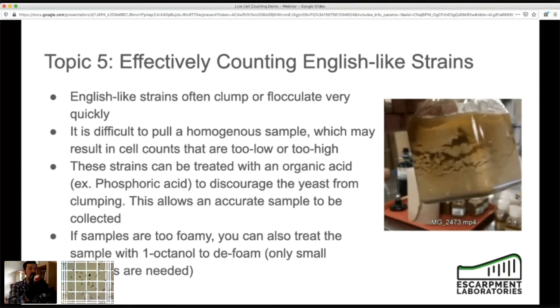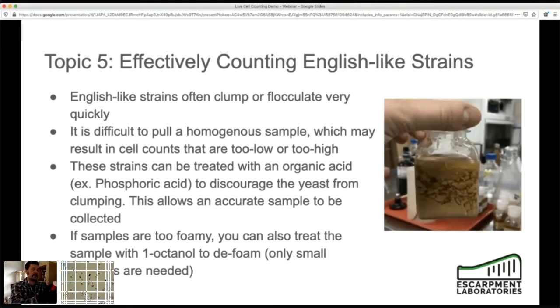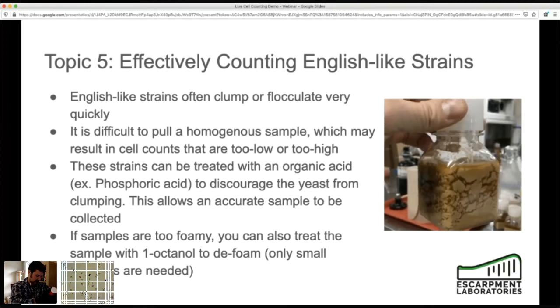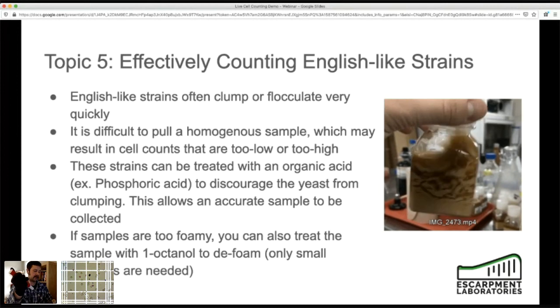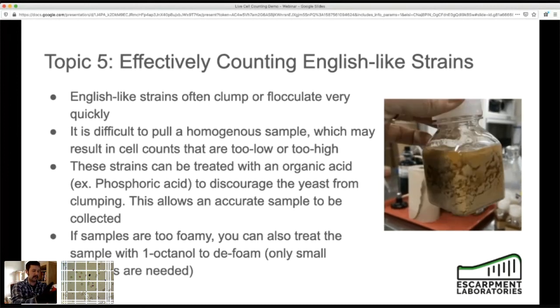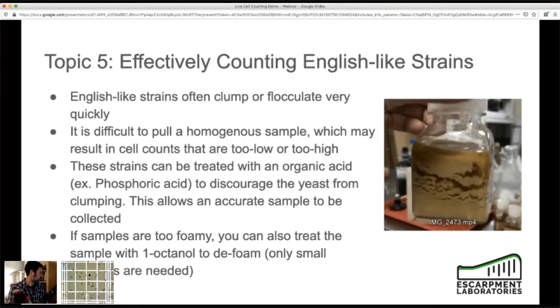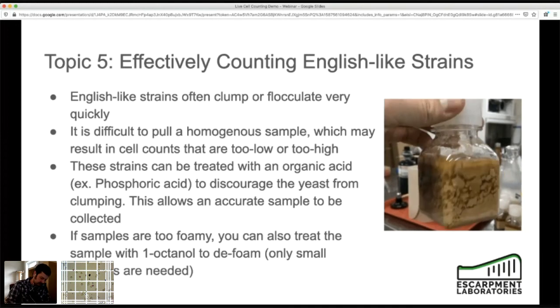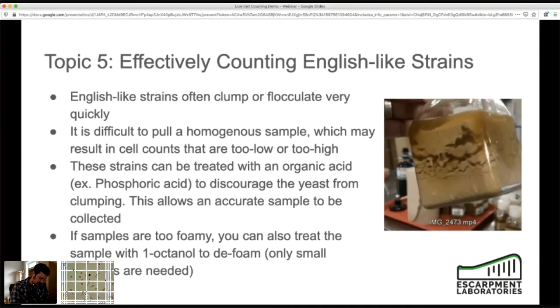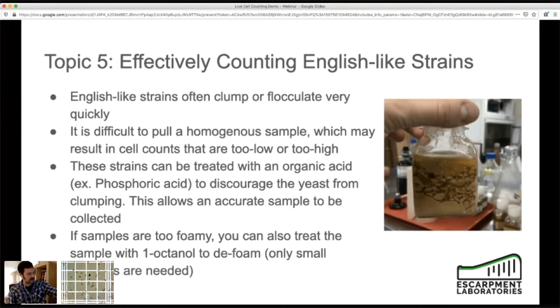Another thing when doing stuff like this is that these acids are dangerous. So wearing gloves and PPE is appropriate because you don't want to get them on you, because you can get chemical burns. So again, just dose that in there. I'm going to clean this off my desk, and then I need to remember to wipe it down after. And then you can just vortex it or shake it.